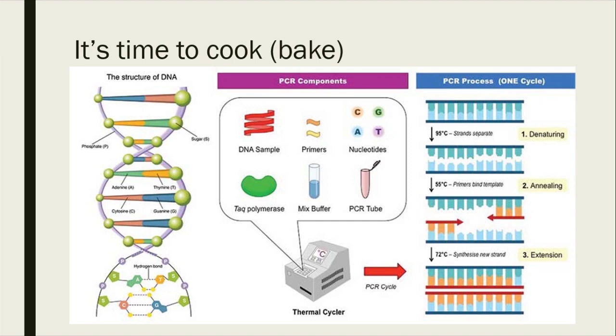Okay, so it is time to cook. And why I say it is time to cook is when you do a PCR reaction, it is almost like baking, because you need a lot of ingredients being put in there. Here are some of those ingredients.